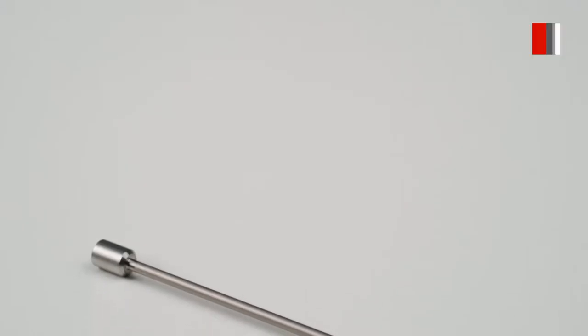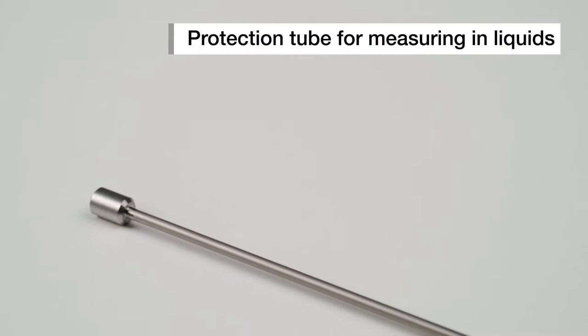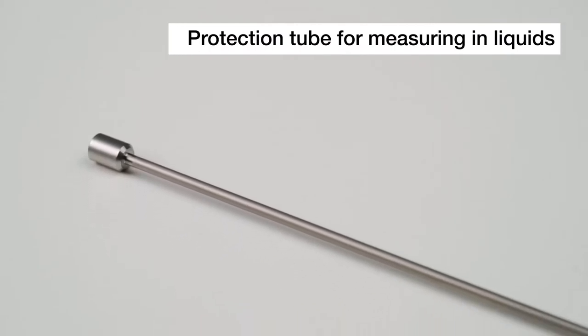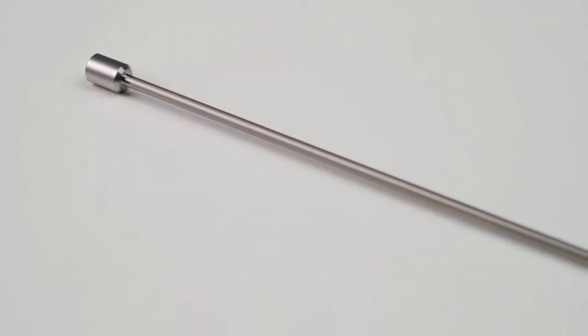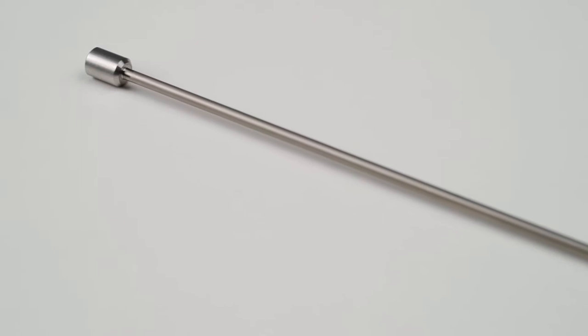A stainless steel 35 centimeter protection tube for measuring in liquid baths can be ordered separately.